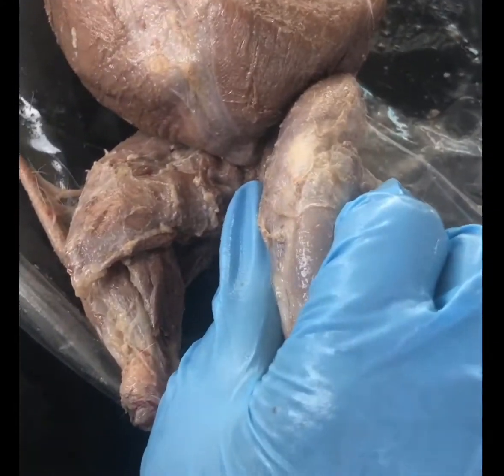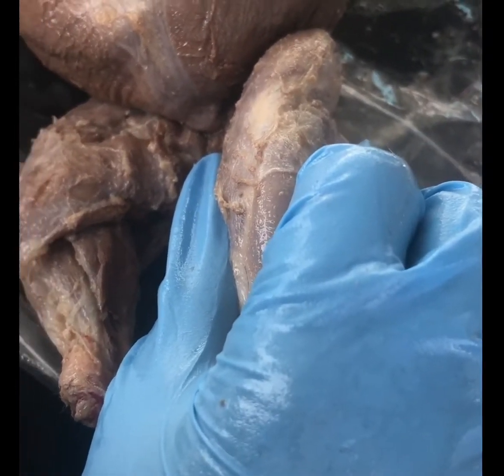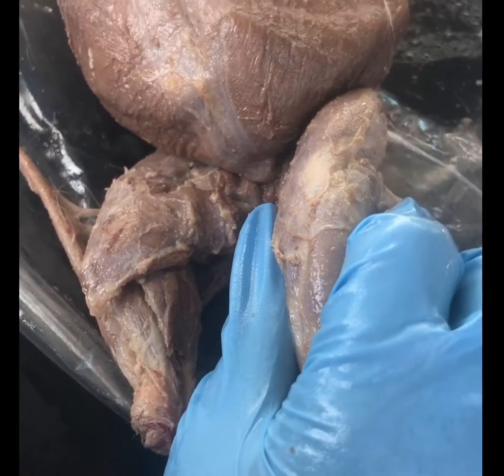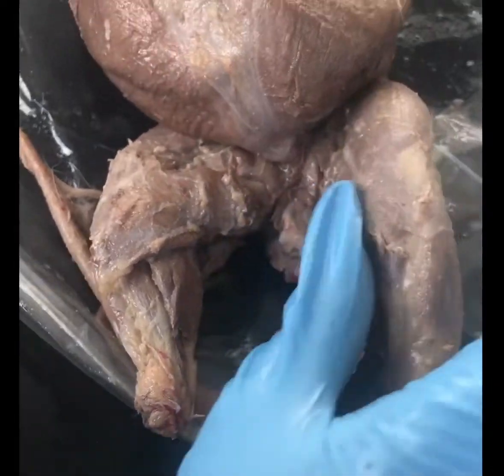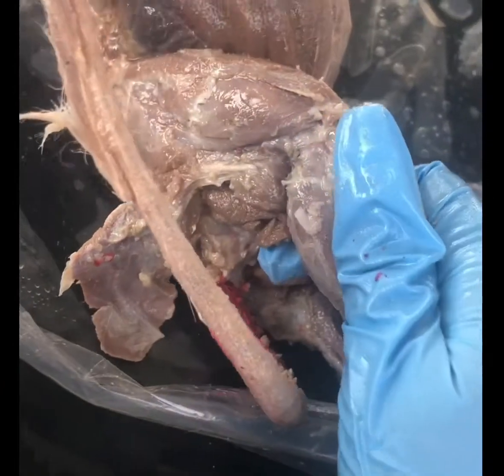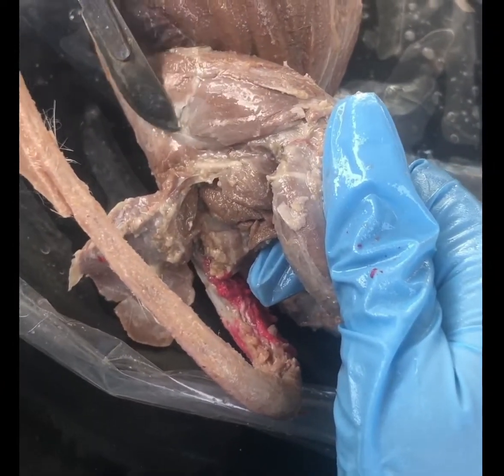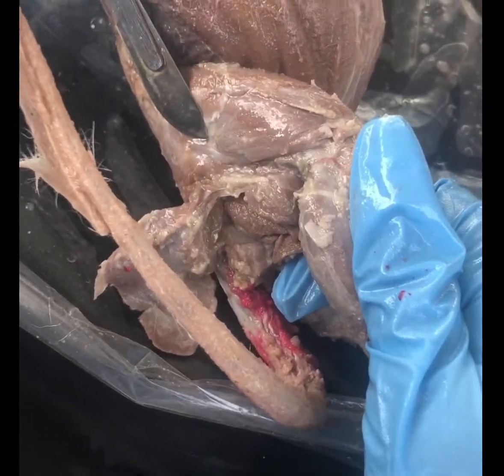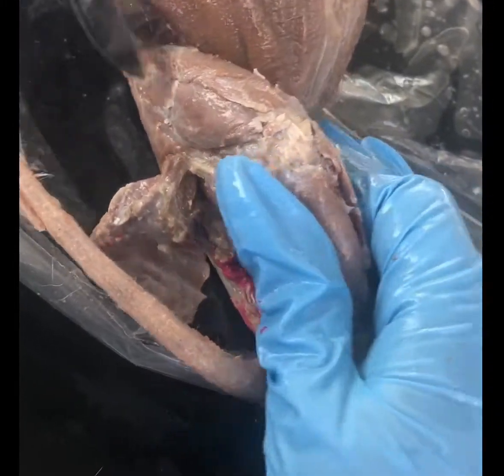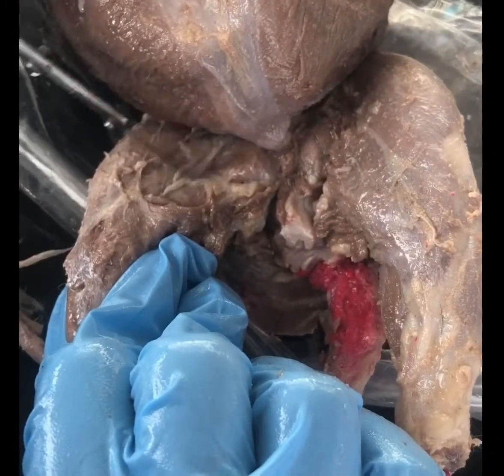And then the vastus lateralis, it's at the end. It extends the leg, and it's on the side. So it'd be like the side of the thigh would be like this muscle right here. The vastus lateralis. The vastus medialis is on the inner. This is the outer, and then the inner. So the vastus medialis would be right here.